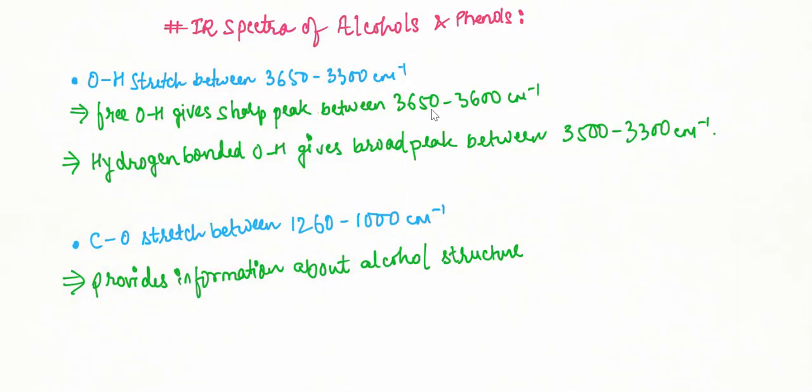Alright guys, so now let's start with our class for today. Today we are going to talk about the IR spectra of alcohols and phenols. What are the characteristic peaks that we are getting? We are going to see that first, okay?